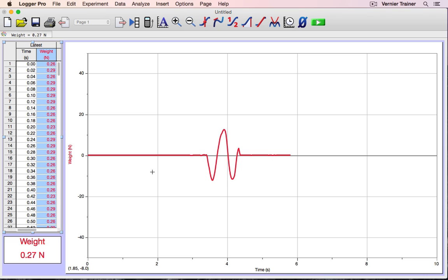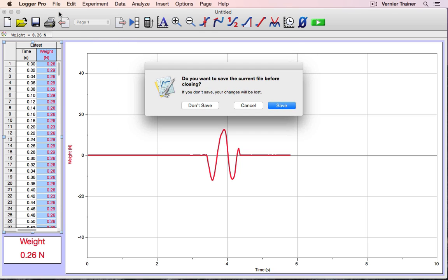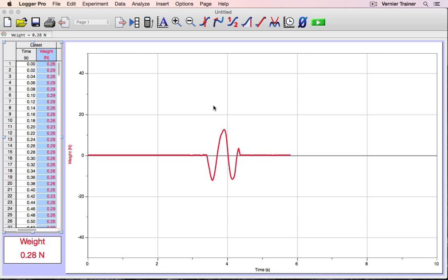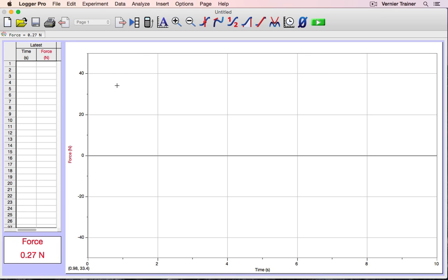If you've made changes to a Logger Pro file that you don't want to keep, or you just want to start with a blank slate, opening a new file is the easiest way to do that. It will prompt you to save it or not. In this case, I'm not going to. And Logger Pro starts over, back to where I began.